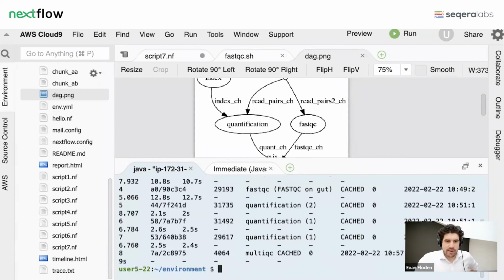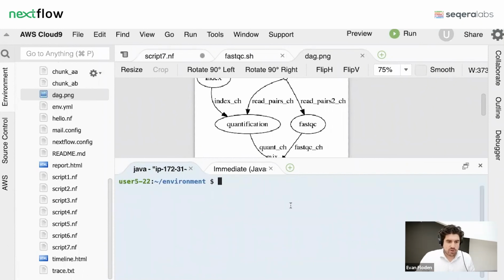Okay, I want to jump now into the section on GitHub, and this is where things start to get really powerful in terms of what we can do. So far, we've been running everything locally. Like we've been saying nextflow run, pointing it to a .nf file. If I've got a config in that directory, etc., it's going to pull that information in and run it. But what becomes more useful is actually running things directly from remote.